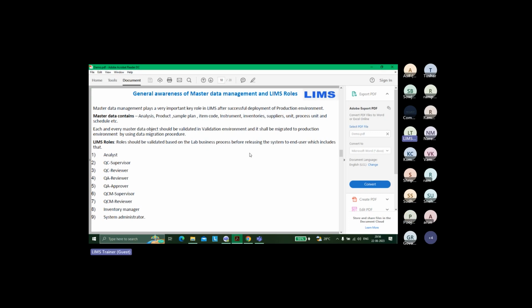An analyst should log in and do only his task, right? He should not get the privilege to supervise. Why should he? We work in a regulated industry. The pharma industry is a regulated industry. Who has to do what? He should get only those privileges. This is a closed system and you are being monitored. So why give you extra privileges? We can, but it's not necessary. That's the point where roles come in.